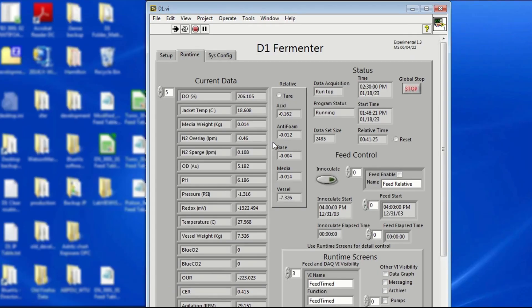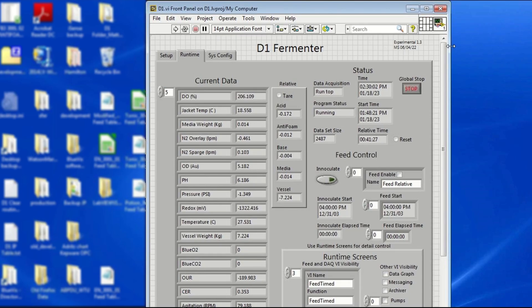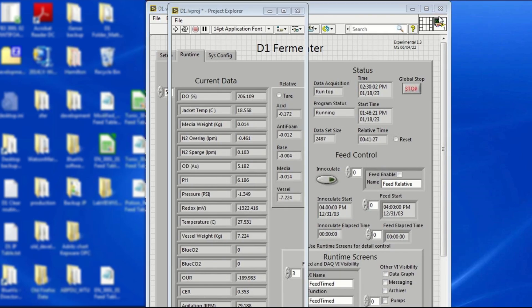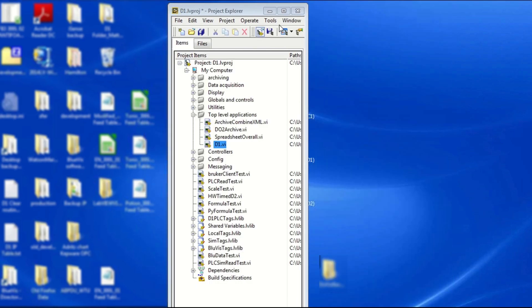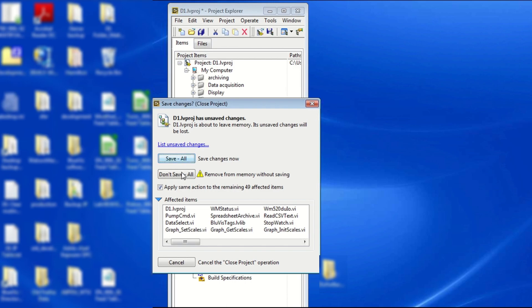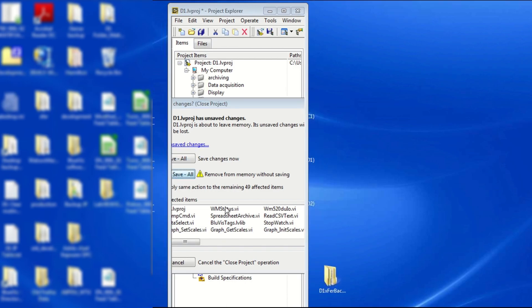LabVIEW needs to be shut down once you've completed your project. To do so, click Global Stop. And then, exit the software by clicking on the X button. Close the project and click on Don't Save All to prevent permanent changes on the system.